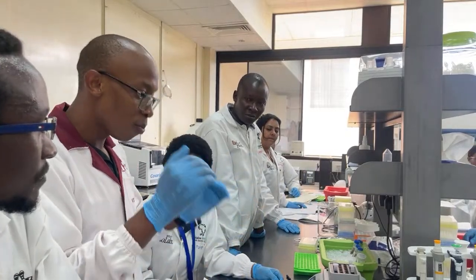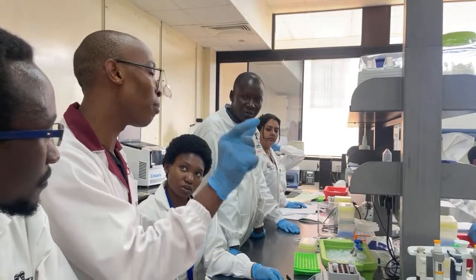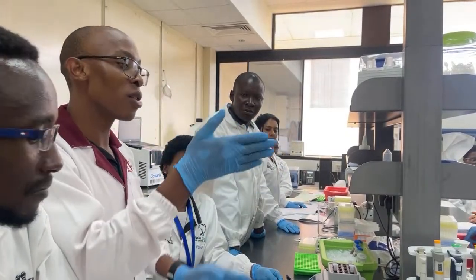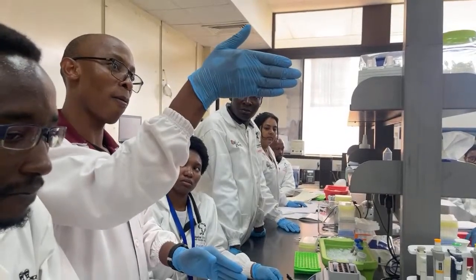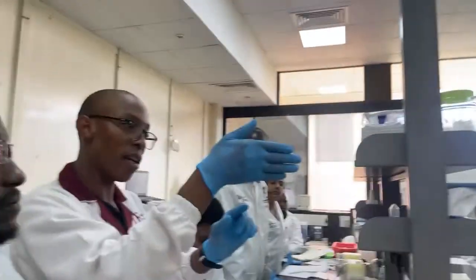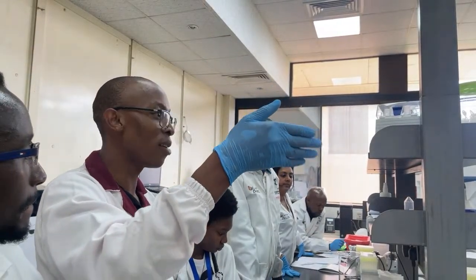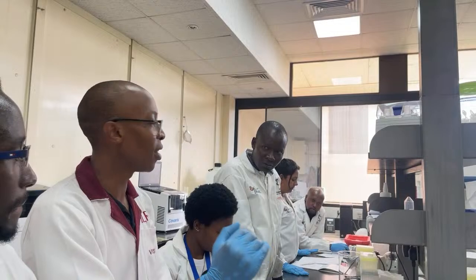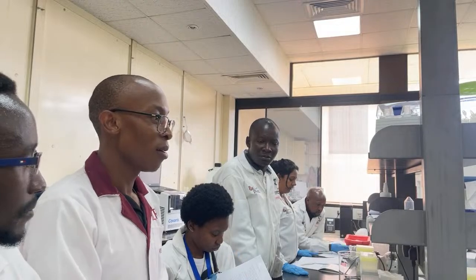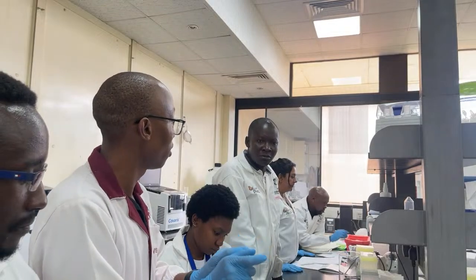Once you start to dive into library preparation, you want that specific number, because you're telling the machine my size is this. If you run the gel, that's just an estimate. You say, okay, my size is this, let me load a certain amount, only to find out your specific fragment is actually lower than that. You're underloading the cell, so you're wasting the cell. So you need that specific number to calculate nanomolar.